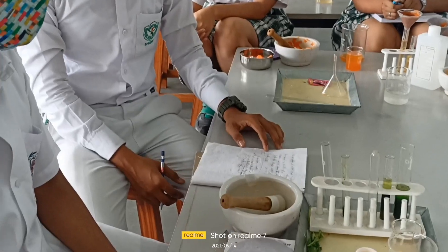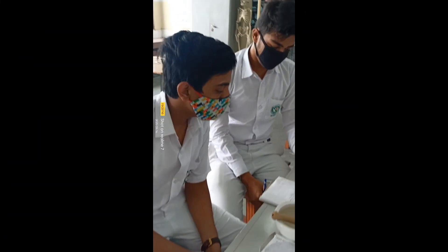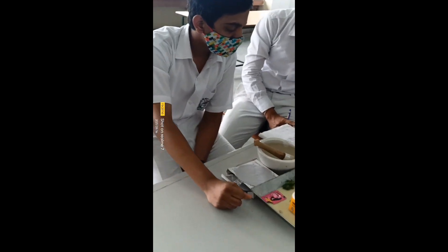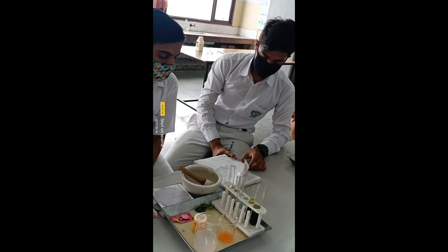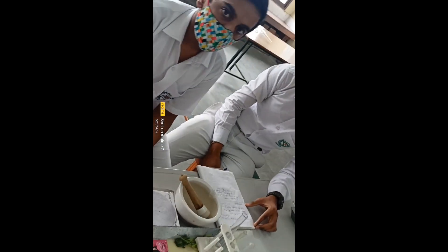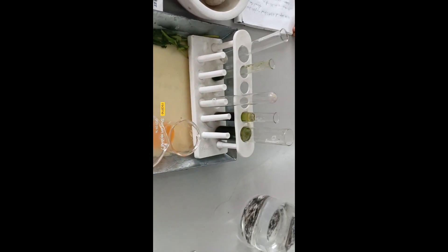I'm going to perform the DNA extraction experiment from spinach leaves. We have isolated the DNA from spinach leaves.